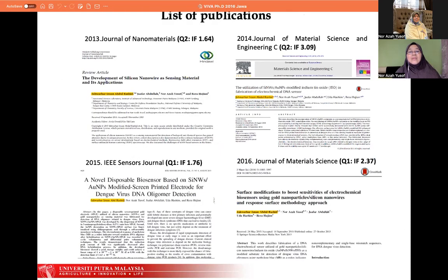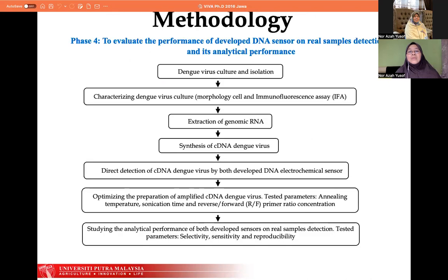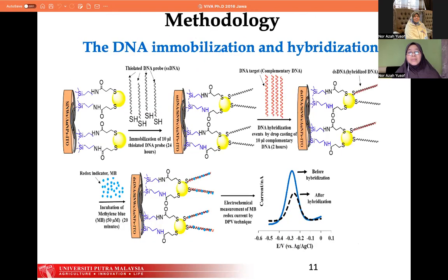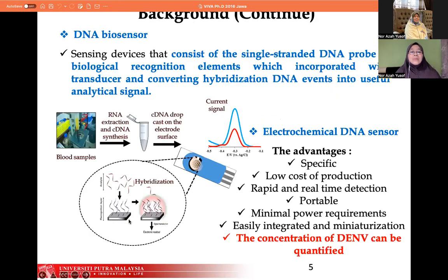So the first thing that you need to do is, of course, to identify a correct gene sequence for the DNA probe. Let me go back to this one. So the DNA probe that we wish to put on top of the electrode has to represent the gene sequence of the dengue virus. If this DNA probe is not correct, then of course you're going to get a wrong reading. So that's the biggest challenge.